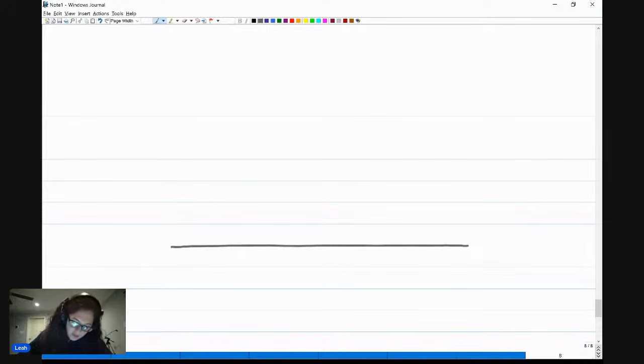On this graph, we have a singlet, which I'll draw in purple. Actually, I'll put the numbers in after. So we have a singlet all the way to the left. And then just at around 1, we have a, oh my goodness, I can't see what I have there, a triplet.